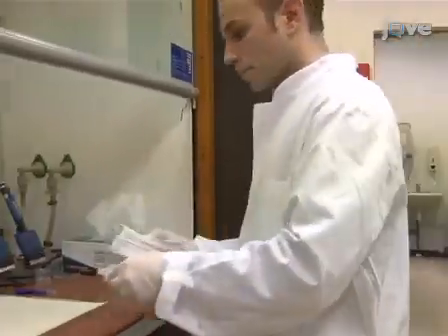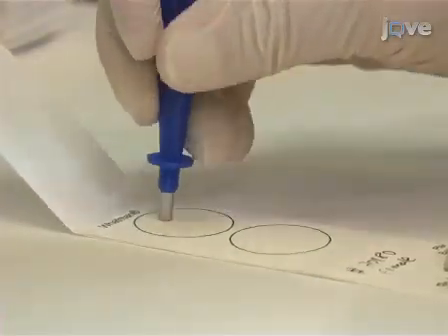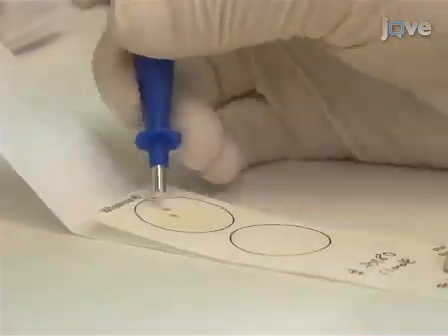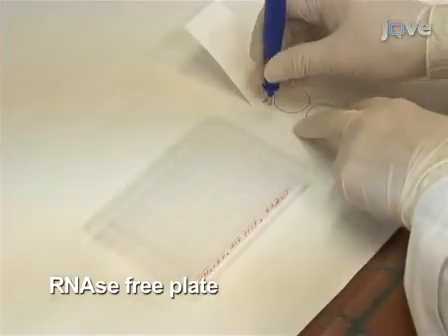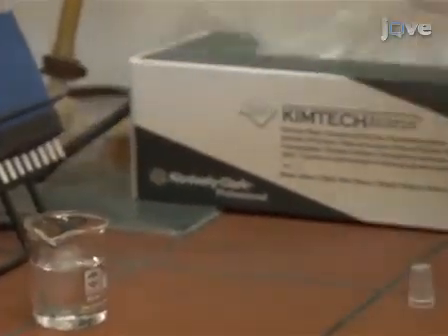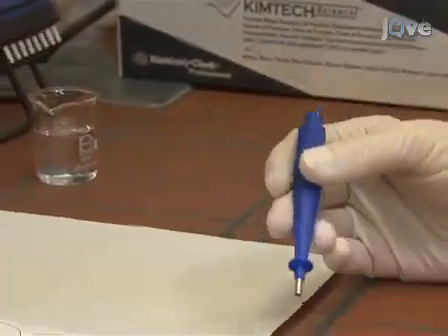Working under a fume hood, begin the viral RNA isolation procedure by extracting the FTA card material, including the feces. Using a Harris 2 mm puncher, punch 3 discs and place all of them into a well of an RNase-free 96-well plate. Between each new sample, clean the puncher carefully with alcohol and a Kim precision wipe.